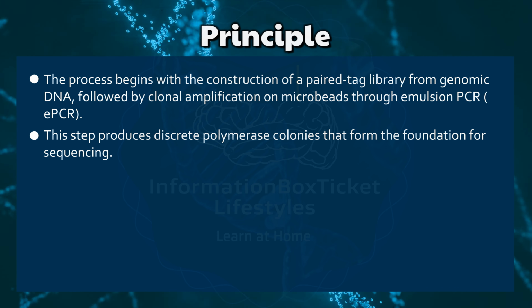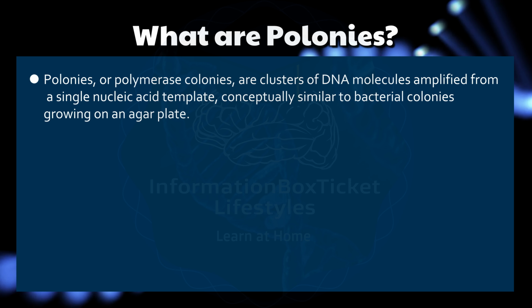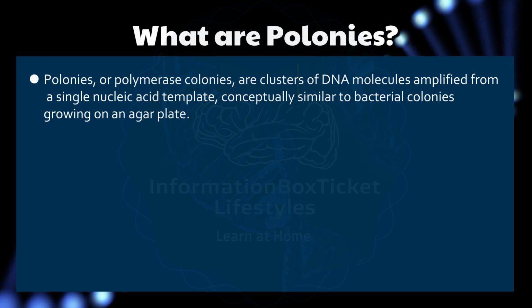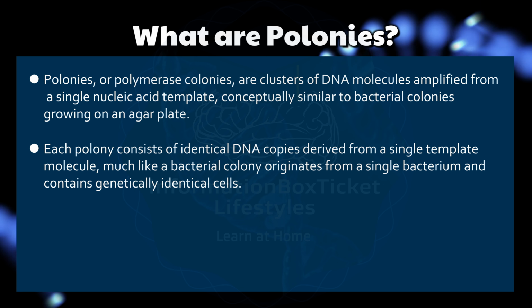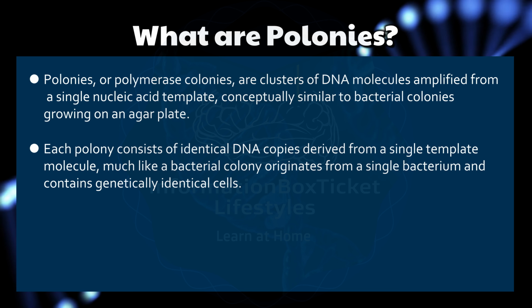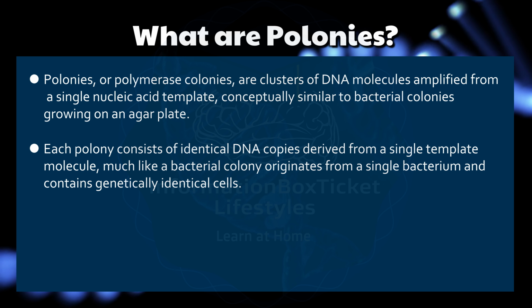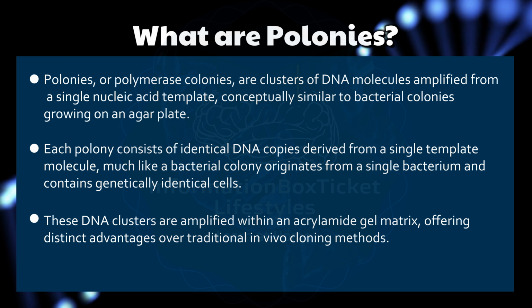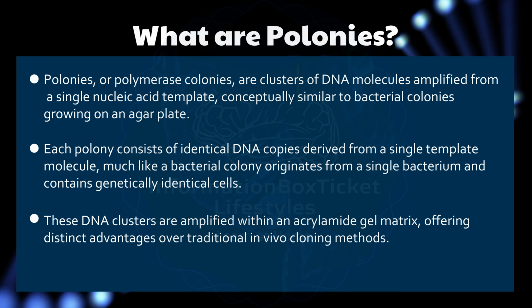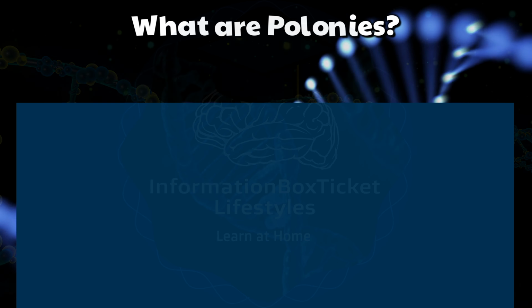What are polonies? Polonies, or polymerase colonies, are clusters of DNA molecules amplified from a single nucleic acid template, conceptually similar to bacterial colonies growing on an agar plate. Each polony consists of identical DNA copies derived from a single template molecule, much like a bacterial colony originates from a single bacterium and contains genetically identical cells. These DNA clusters are amplified within an acrylamide gel matrix, offering distinct advantages over traditional in vivo cloning methods.